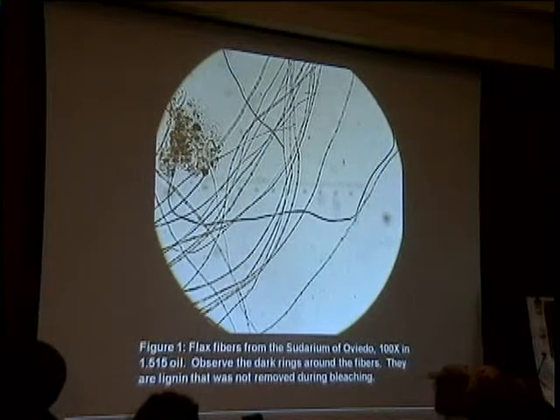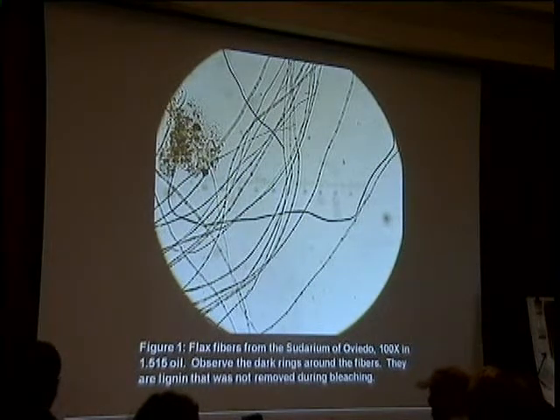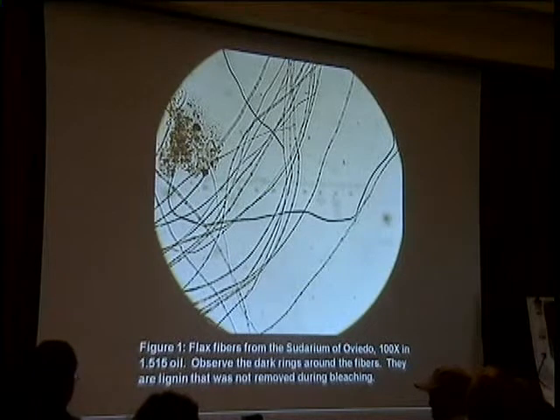Also visible is a blue cotton fiber that lies across the flax fibers. Cotton is easily identified on the basis of its tape-like structure and periodic reversals. The dye appears to be indigo. The fiber may have some historical importance, but I cannot pursue the question.